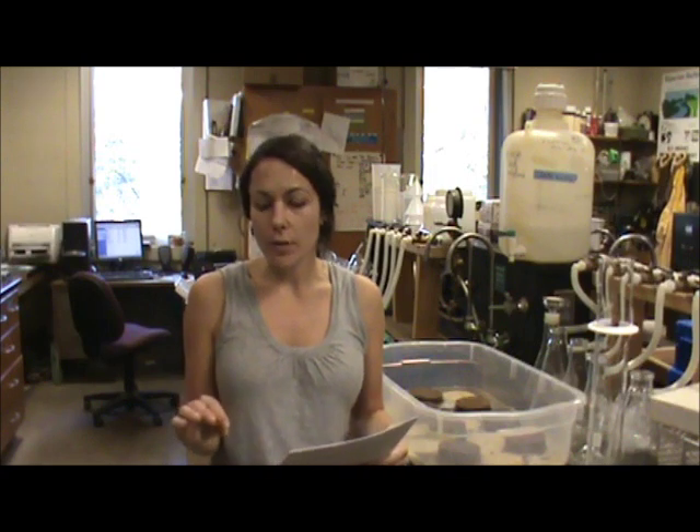Today we're going to go over lab exercise two. In this lab we're going to take one of the soil samples that we took in the rain garden in lab one, and we're going to use it to determine the soil water characteristic curve, which you'll go over in class. It's basically a relationship between the matrix soil potential and the soil water content.